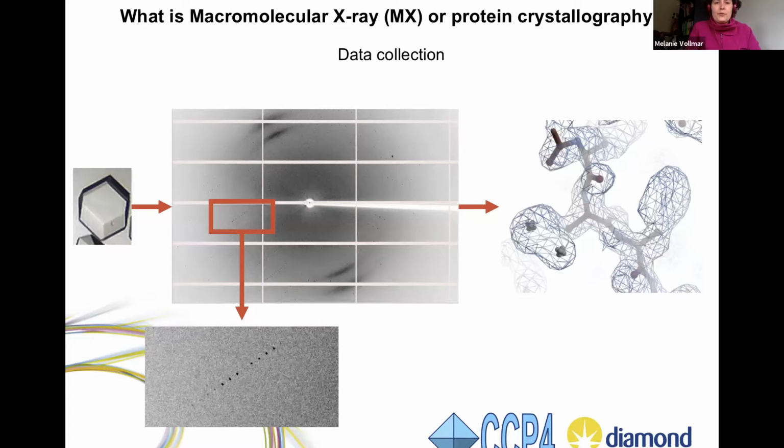If you want to have a structure like that, you can do that with protein crystallography and using a synchrotron. Therefore you use a protein crystal. This one here is, I believe, lysozyme. You put it in an X-ray beam, it diffracts, you collect the diffraction pattern, so those little black spots here on a detector, integrate those with software, and then you think, yee-hee, that's it all.